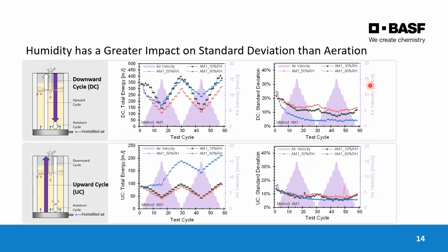So this is a slightly more complex data set. We won't go through all of it, but I will just focus on this one down the bottom here, okay? Now in the FT4 experiments, you are aerating the powder bed. You're flowing air through the bed. And therefore, within that, there's a risk that you'll aerate the bed. It'll become fluidized. So in this experiment, we changed the velocity of air through the bed just to see whether that affected the results. And this is for sodium chloride.